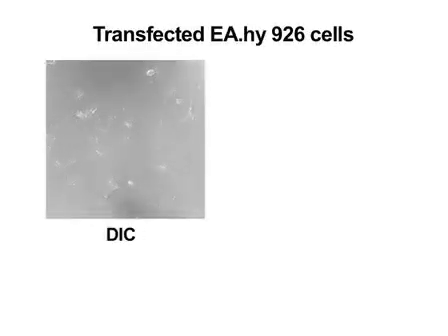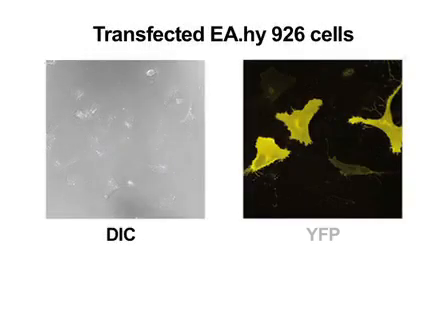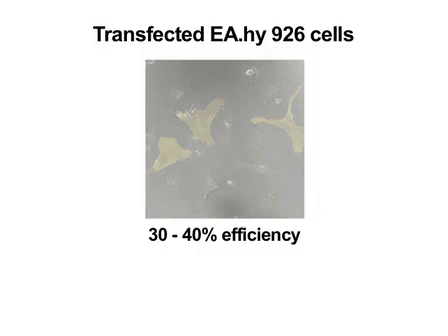Individual receptors should be fused to both CFP and YFP with varying lengths of juxtamembrane sequence to identify the best possible pair of receptor FRET partners. Transfection efficiencies are typically between 30 to 40%. Despite previous findings by others, we have not seen that transfection and expression of one vector favors that of the other. Indeed, we frequently observe exclusive expression of one fluorophore chimera or the other.